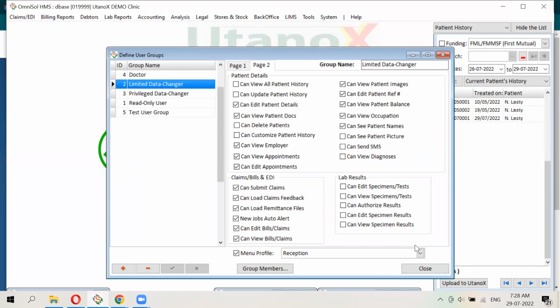Yes, because I'm actually having a challenge with that, because my people who are at small centers are not able to do invoices for the client once the client is there. I want the client to be able to know how much they're supposed to pay, and then their invoice can be printed. So okay, fine, medical aid is going to cover, let's say, 55 pula, then you owe us 5 pula. Then they can see that there and then. That's one challenge.